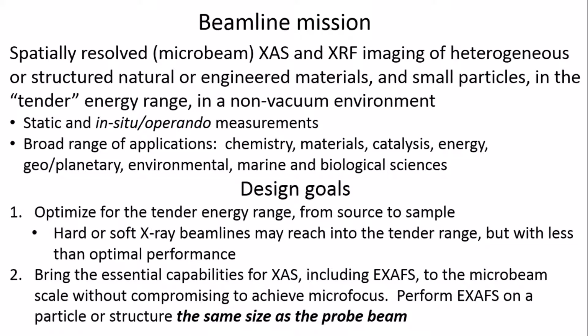The design goals for the Beamline, kind of the Beamline vision that we had for it, were twofold. One is to optimize for the tender energy range from the source to the sample. So the entire Beamline is optimized for this. There are many hard or soft X-ray beamlines that can reach partly into the tender energy range, but with less than optimal performance. TES is optimized specifically for that energy range.